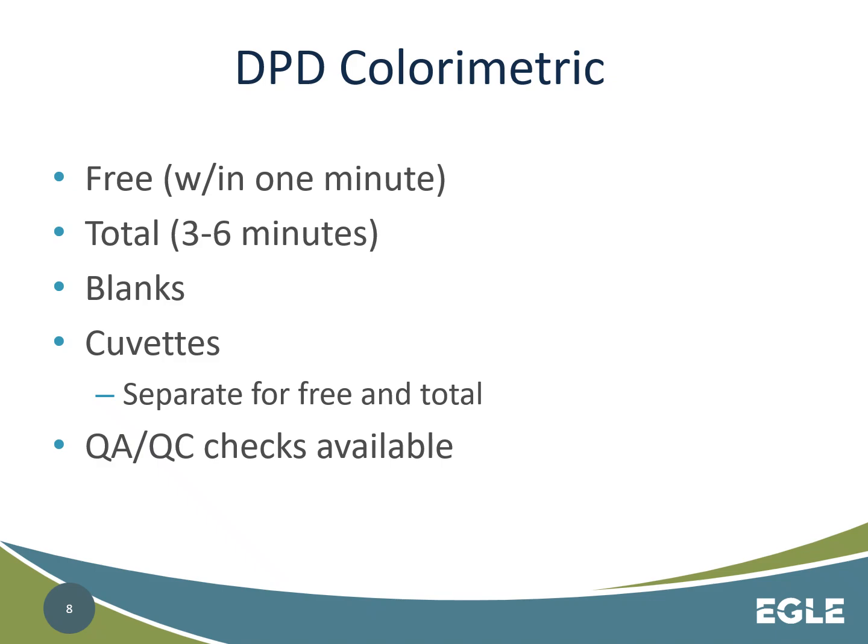Now, again, if you're taking a mid-range or high-range reading, these have their own powder pillows, sometimes 2, sometimes 1, and the amount of water or solution needed is going to be higher. Typically, those are 25 milliliters, all right? So there's some QA/QC done, and what I mean by that is, every time you get a new set of powder, measuring it against a known standard calibration to make sure that it's within its factory reading.